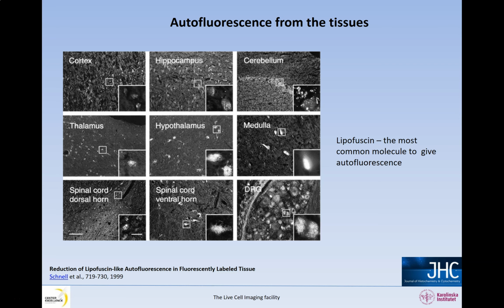Autofluorescence sometimes shows up as a general background, but sometimes it looks incredibly specific and shows up in only one cell type. When working with a new tissue, start with imaging unstained tissue to understand in which channel the autofluorescence is a problem. In some cases, simply choosing an antibody labeled in another channel solves the problem.